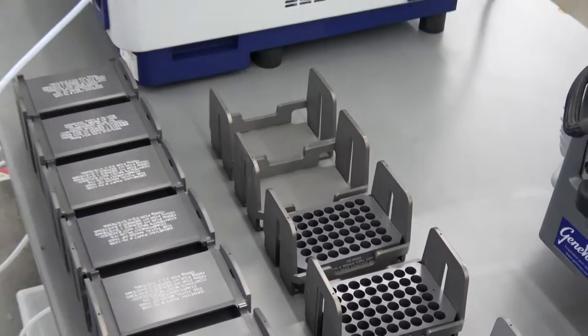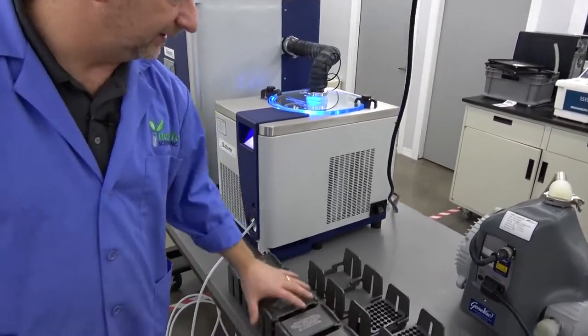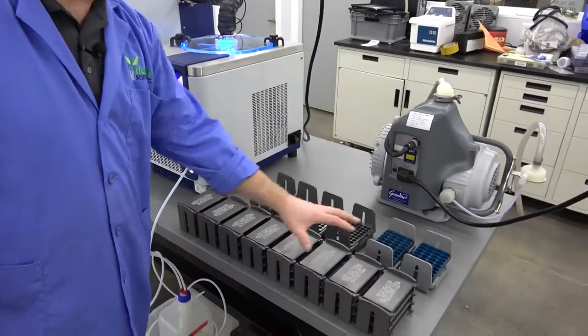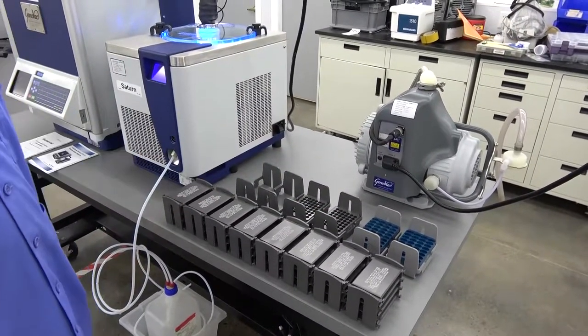And then also you've got two of these. These are the 11 millimeter by 40 millimeter tube holders. And of course, just two empty ones there yet. So you've got a variety. Now this bucket inside will hold up to 12 of these. So we have 14 total. So you actually got two extra here, but 14 total there.